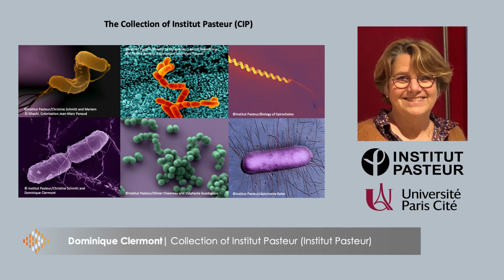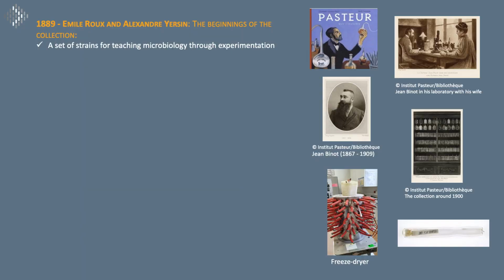Hello, I am Dominique Clermont, head of the collection of Institut Pasteur, the CIP, from Institut Pasteur, Université Paris-Cité. Bacteria of lineages other than the cyanobacteria are preserved at the CIP. It was Émile Roux and Alexandre Yersin who first had the idea to conserve a set of bacteria for practical courses of microbiology at Institut Pasteur.